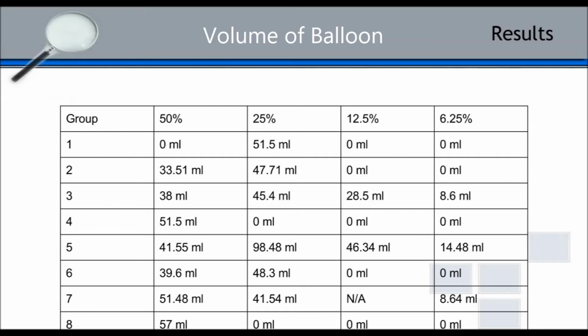But this is clearly caused by variation and error, and it could have been caused by inactive yeast, tight balloons that were difficult to inflate, different treatment by the groups of the balloons prior to testing, whether or not oxygen was actually missing from the testing environment, and just human error.